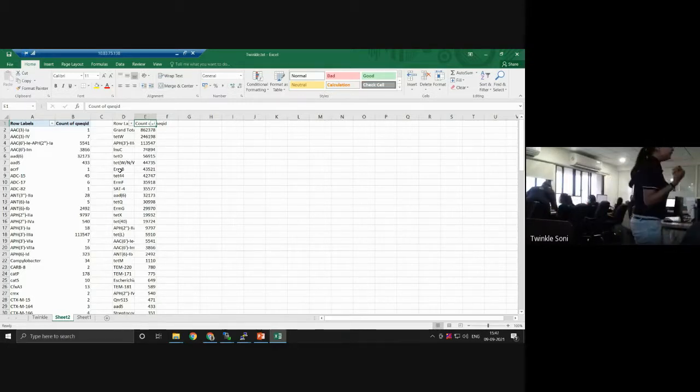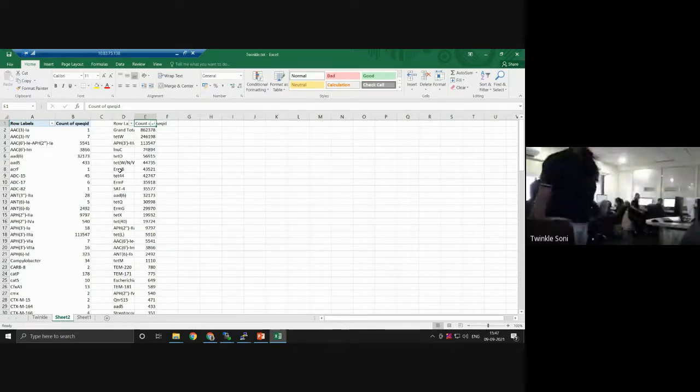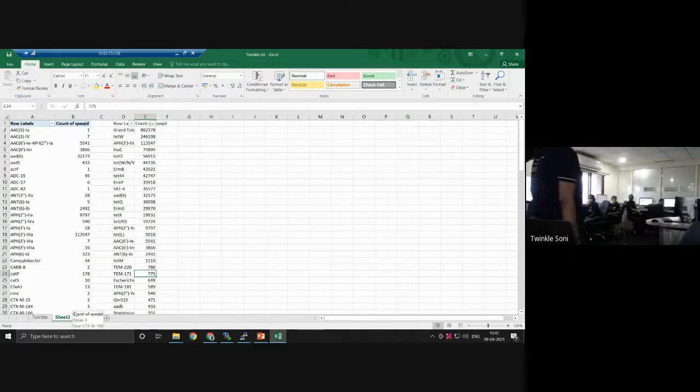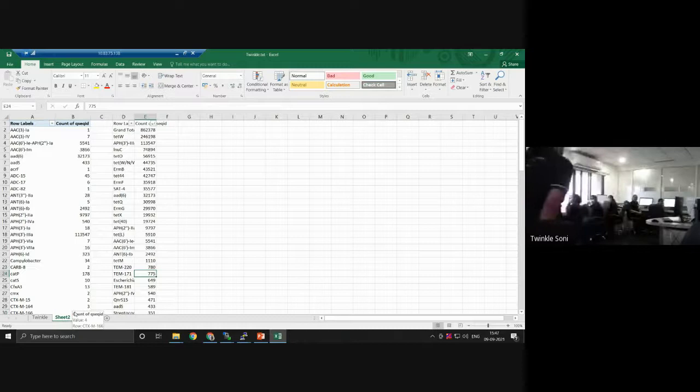Okay, so what exactly is it showing? See, exactly it is showing that total there are 8,62,378 reads. Like these many queries were there. Tetracycline W was the most abundant resistant gene found. It was about 2,46,198. Why we need this is, you don't have to go with individual numbers.